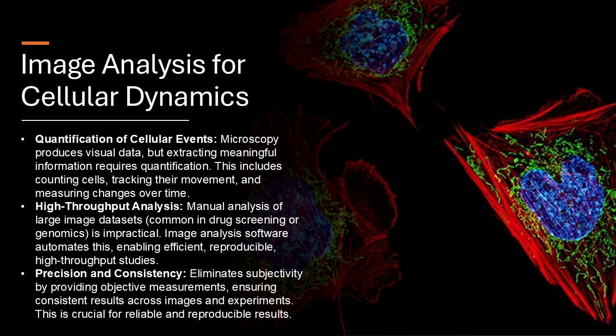Yeah, exactly. And by analyzing these things, we can measure a lot. Like what? Like how many cells are dying, how fast, and what's causing it. So we can really get a lot of information. We can, and it helps us understand the process. This is all so fascinating, but how do we actually go from the images to these insights?